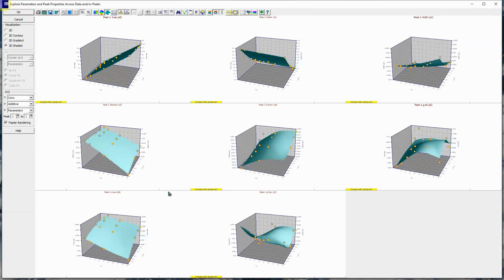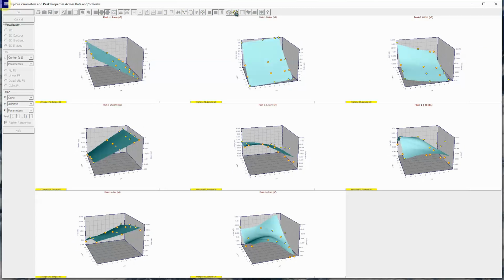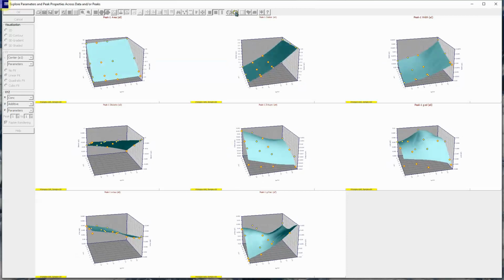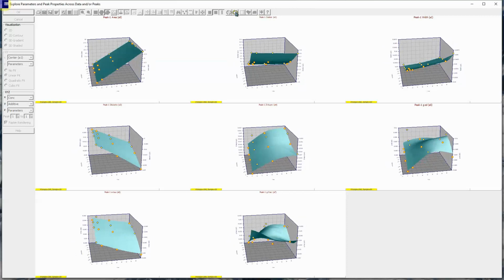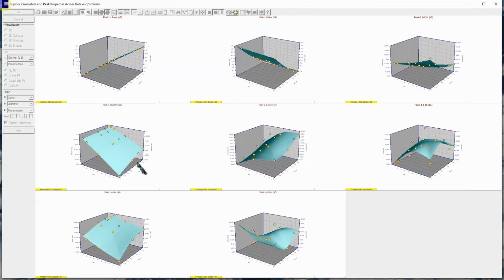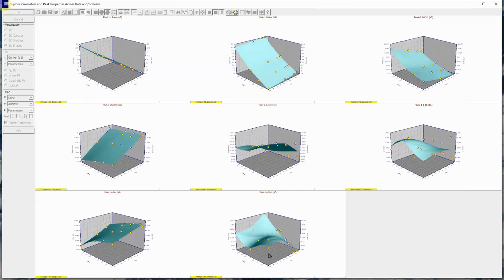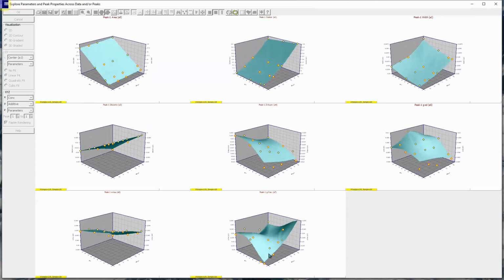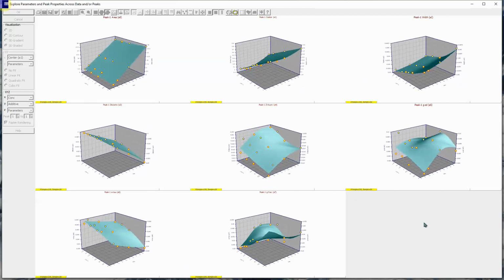One more item I will show here. With some experience, you can use this animation as I'm doing here to get a complete picture of the parametric relationships in an experiment, and you can see it's all within a single vision. You have your A0, A1, A2, A3 core parameters, you have your asymmetry and your IRF parameters, and you get a clear picture of what the chromatographic model is doing across all of the data sets in the experiment.